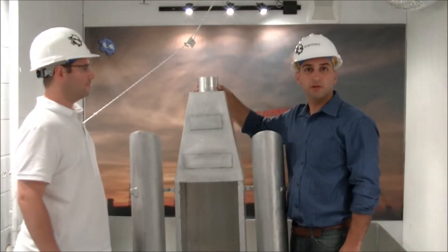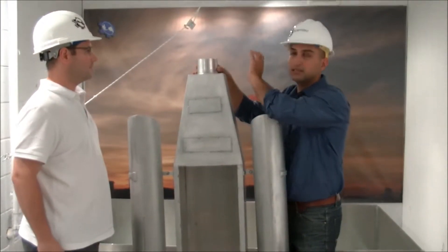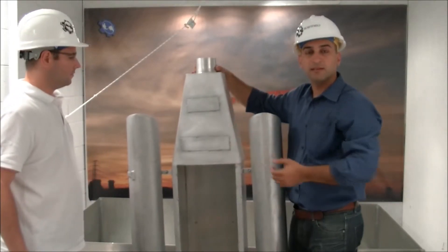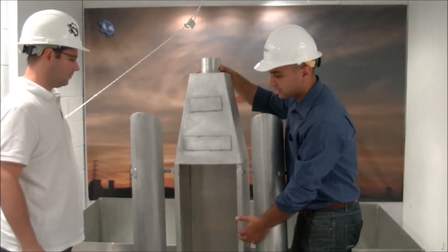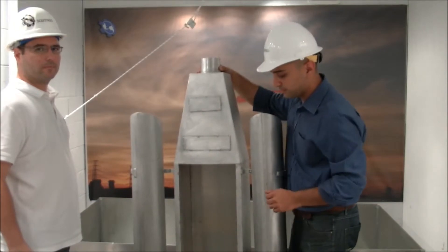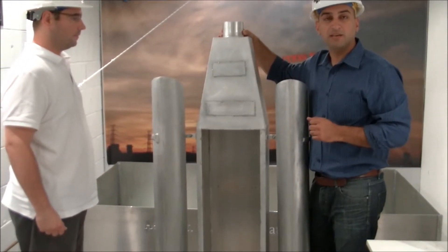Here's how a wind tunnel works: air is pumped in from here. This is clean, odorless air, and it goes over some baffles to make it come in laminarly and uniformly. Then it goes over the open channel where it picks up the odor from the surface you're sampling, and then exhausts from the other end where you take your sample.